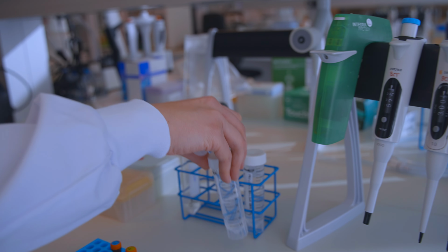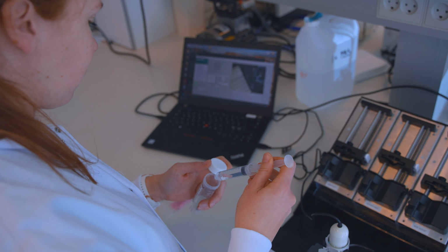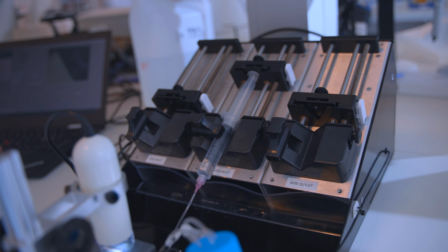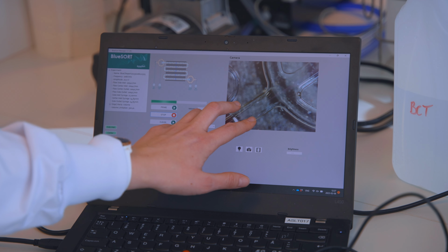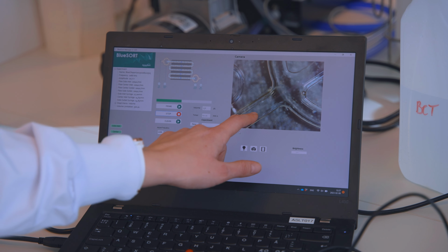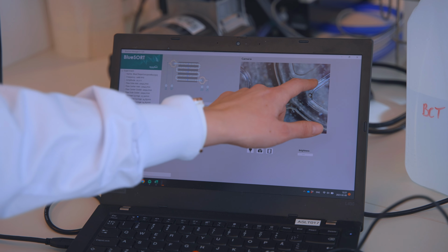Within the Blue4Therapy project, we want to enrich a specific cell population, and to do that we are using a technique which is called acoustophoresis, which uses ultrasound to sort cells based on their properties. So AcouSort has developed a method where we can enrich those cells from unwanted cells in an acoustic field. When we have cells going through our device, the wanted cells are quicker focused towards the center of a channel, while we have all the unwanted cells on the side of an acoustic channel, and they can be separated from each other.